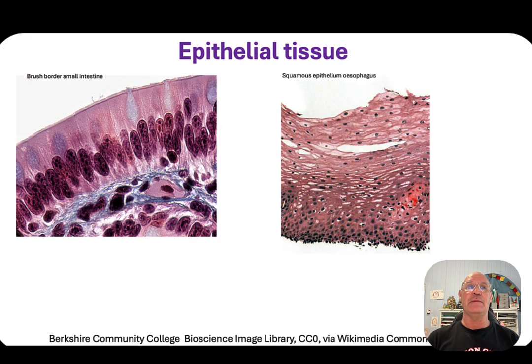And so here's some examples of some epithelial tissue. We can see that they tend to be cuboid or boxy, and they're tightly packed together. And you'll see they also have a free edge. So this is the lumen of the small intestine. The lumen being the inside tube, and so these epithelial tissue actually provide the lining of that small intestine, and they're packed together in a sheet.